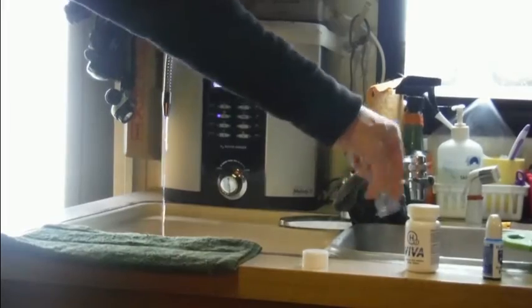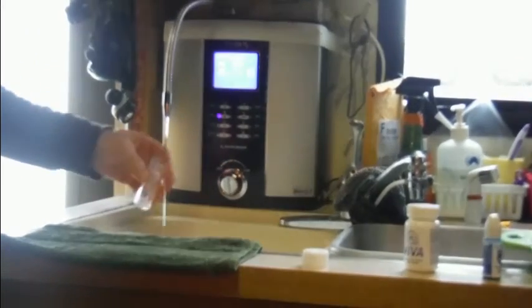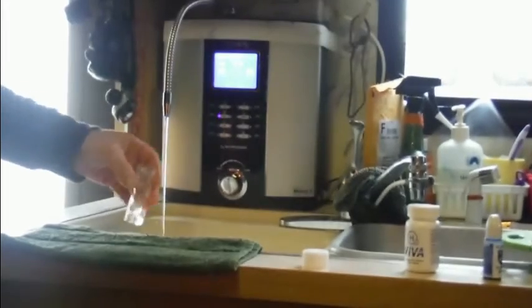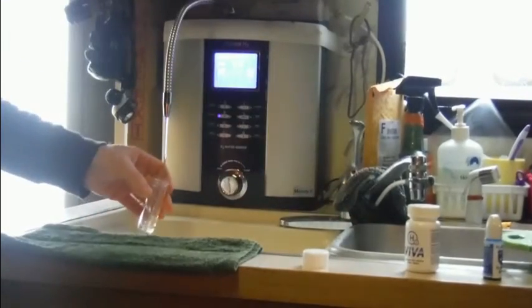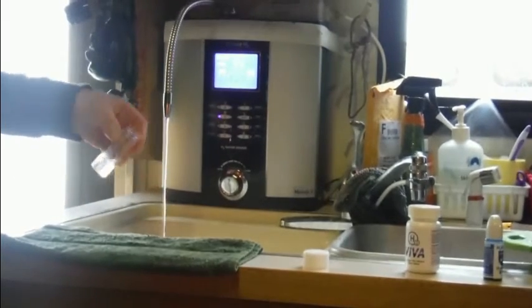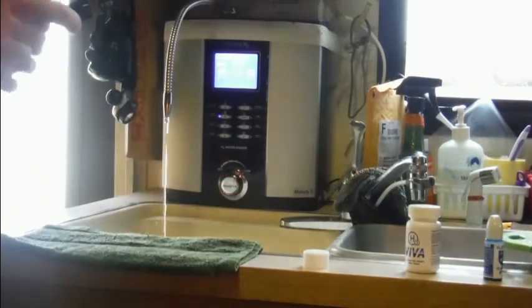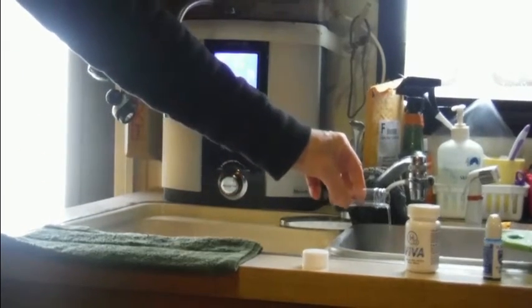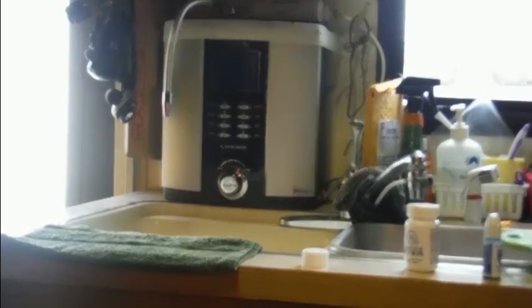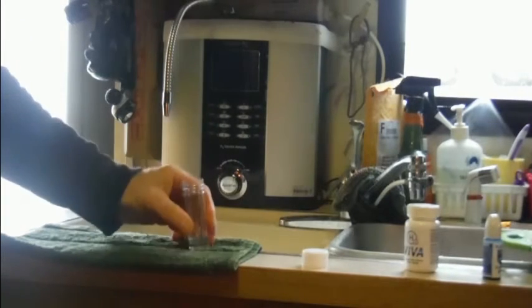I'm going to let it run for a few seconds here. The trick is to get exactly six milliliters of water in the vial — I did it there.